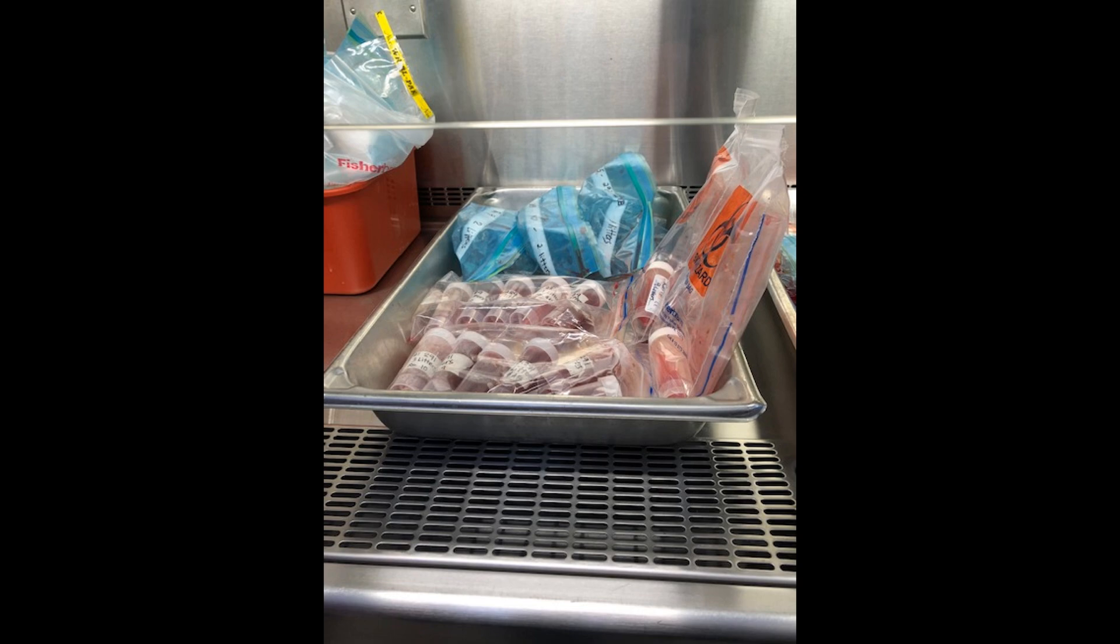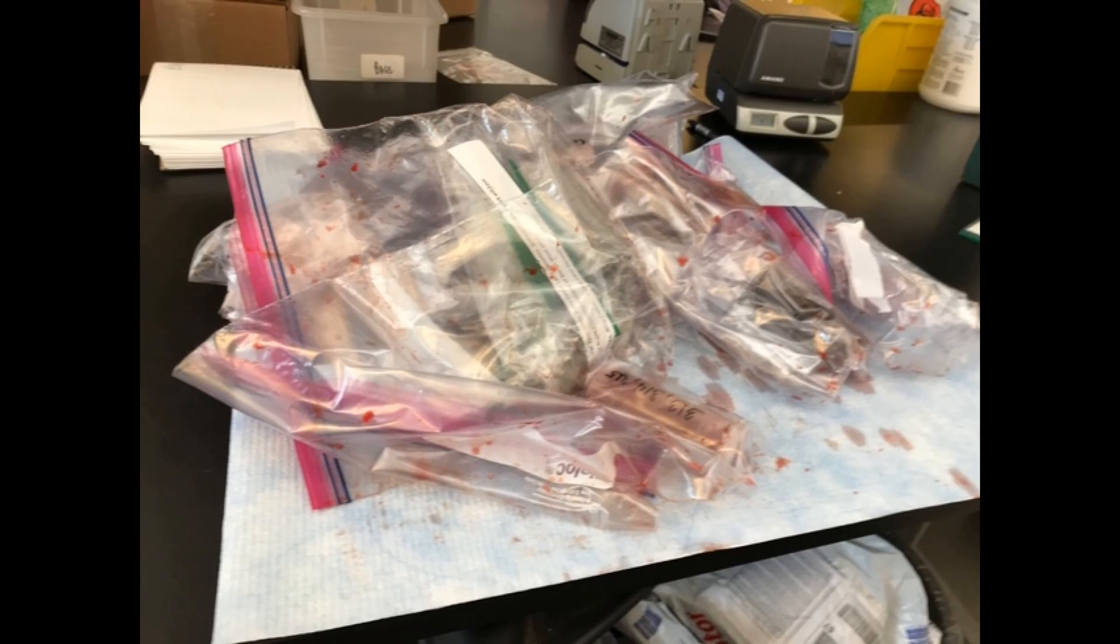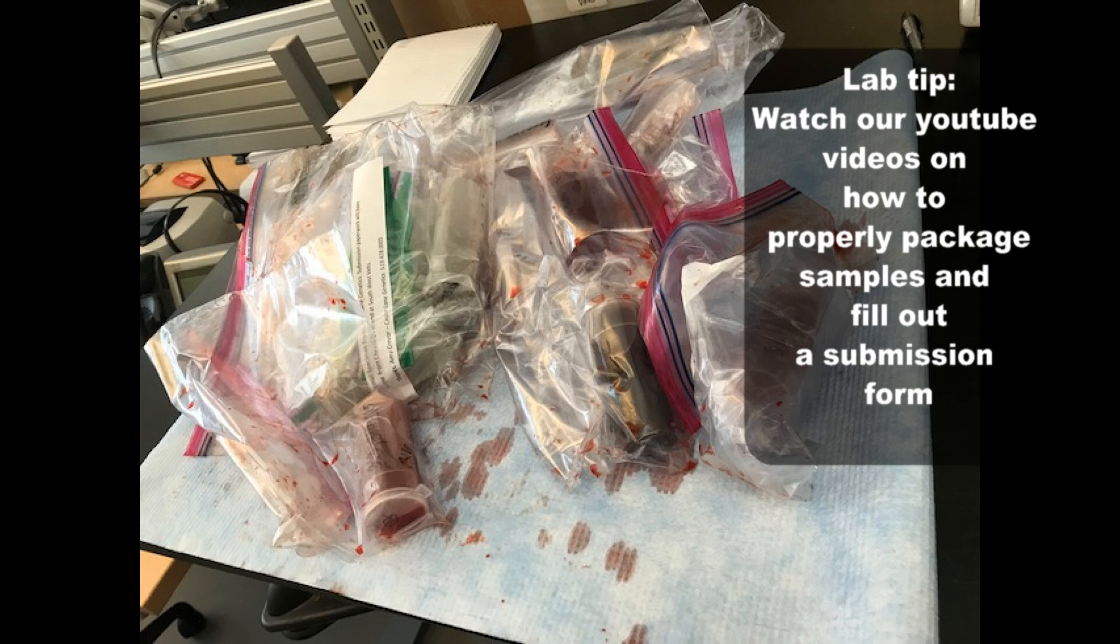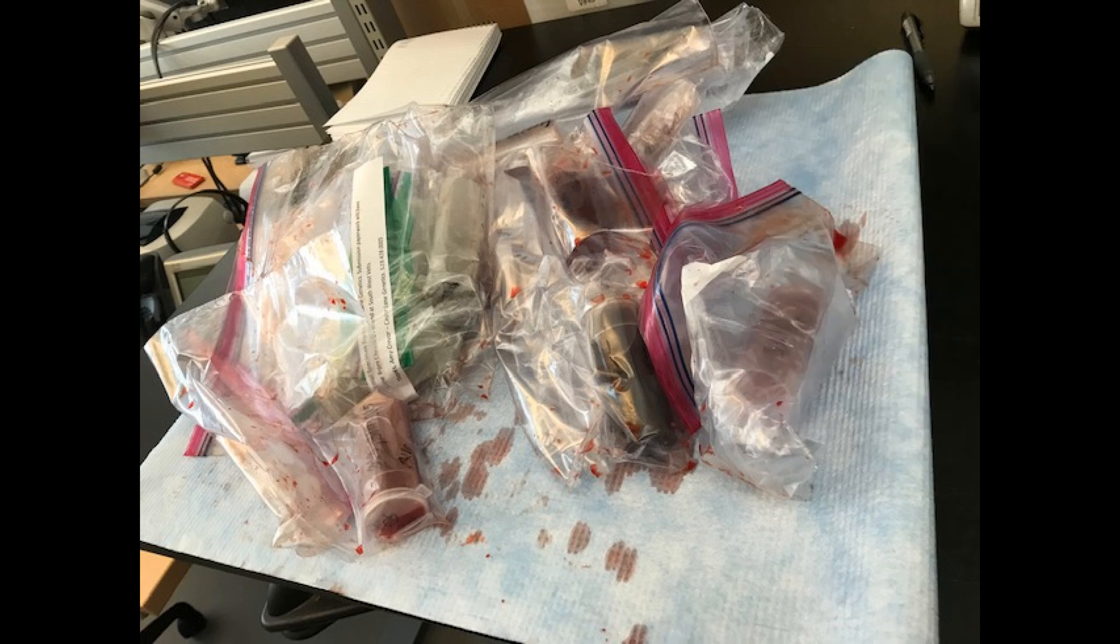Some samples of that can be seen here. You can help by having your staff watch our how to submit series for best practices, using an electronic submission form, and writing clearly and completely on all of your submissions.